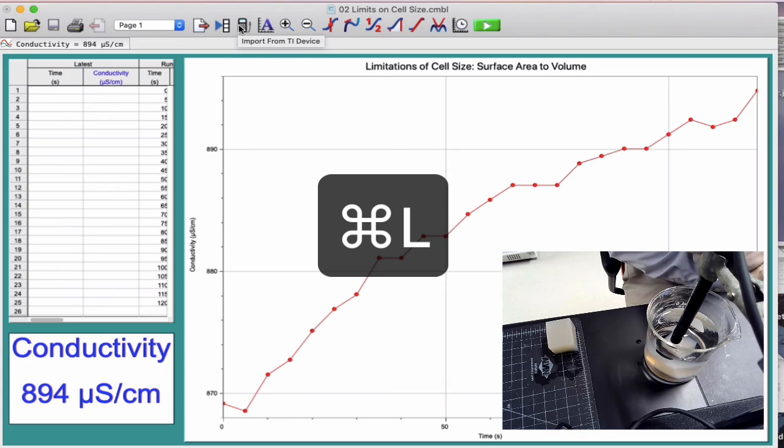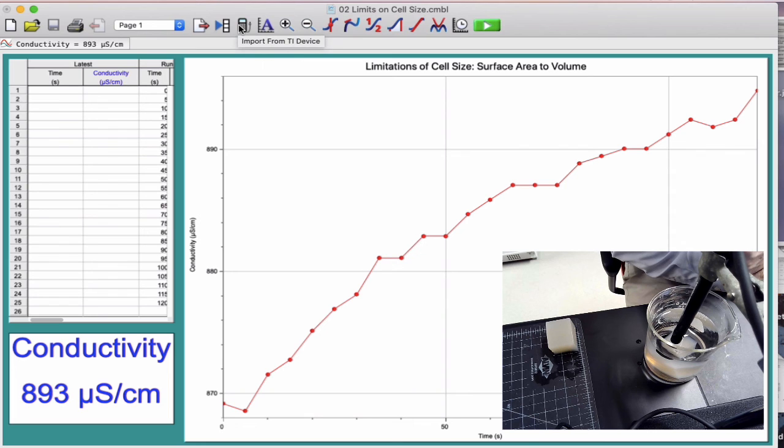So that's the biggest cube. You're going to actually take that cube or a cube like it and make smaller cubes and see how the size, so it's going to have the same volume, but different surface areas. So it'll be an interesting investigation for you to do. So that's just part of what we're going to be doing with this lab.